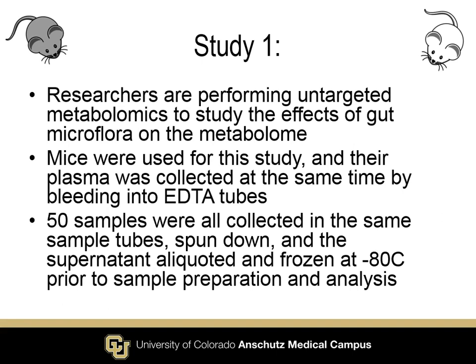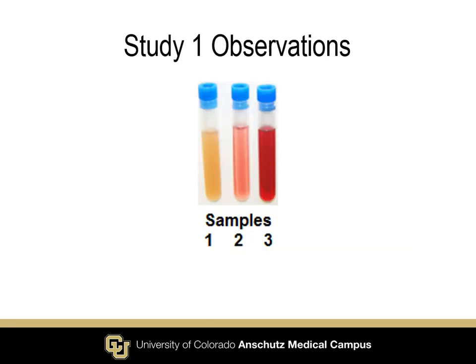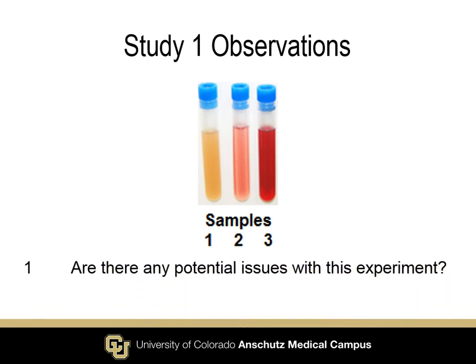The samples were inspected upon receipt, and this is what they looked like. So I want you to take a second here to observe these tubes. This is just 3 sample tubes of what was received. Are there any potential issues that you can see with this experiment? Does anybody have an idea? Yeah?